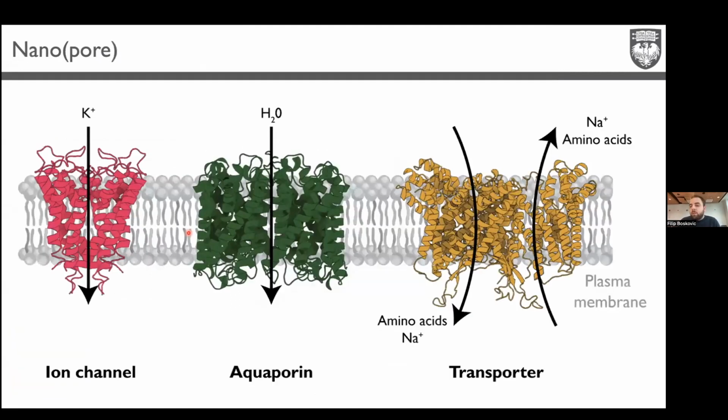When you have maybe heard about nanopore, the first thing you probably understand is a pore. In all our cells, in all our membranes, such as the plasma membrane shown here, we have a lot of proteins that serve various transport functions. One of them can transport ions, like an ion channel. There are some that can transfer water, like aquaporin, or even more complex ones that can transport sodium and amino acids. But what we are talking about are the pores.